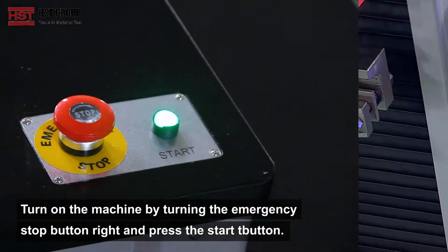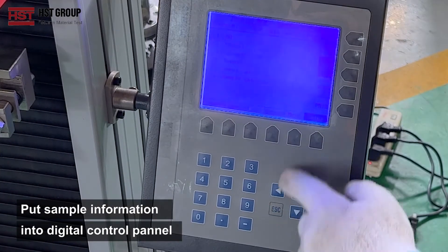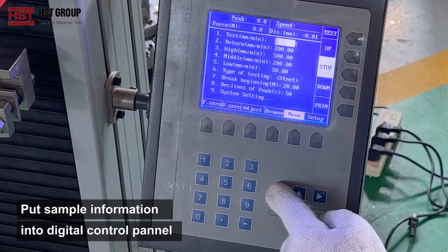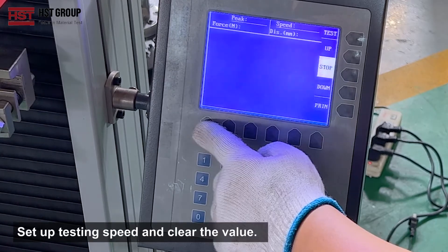Put sample information such as thickness, diameter, etc. into the digital control panel. Set up testing speed and clear the value.